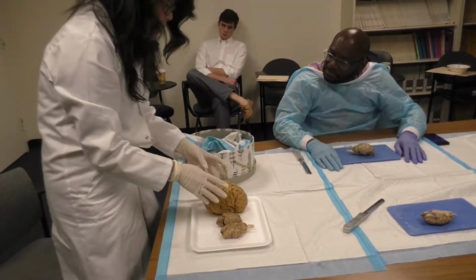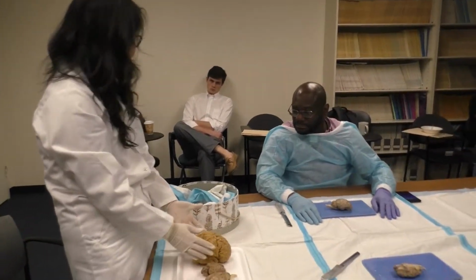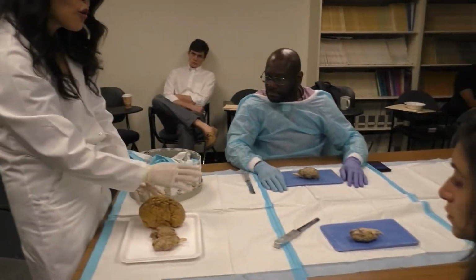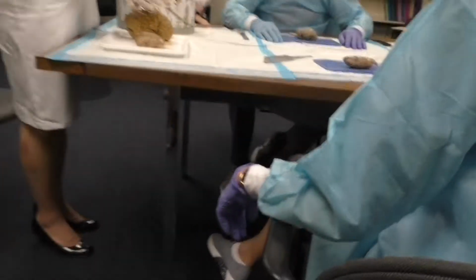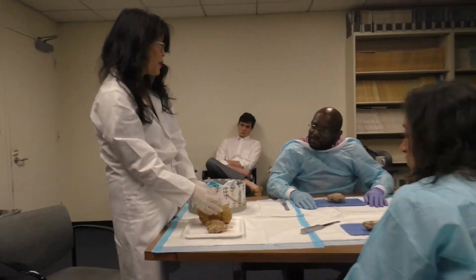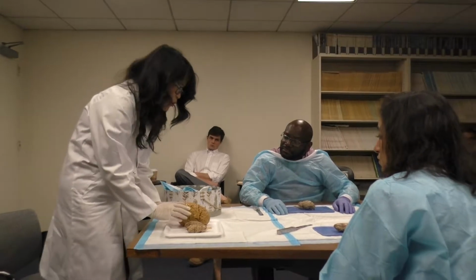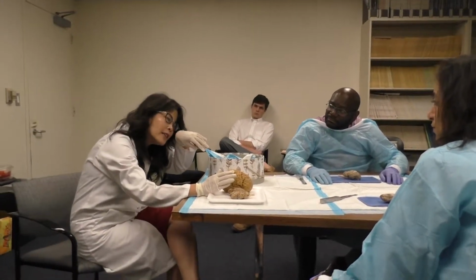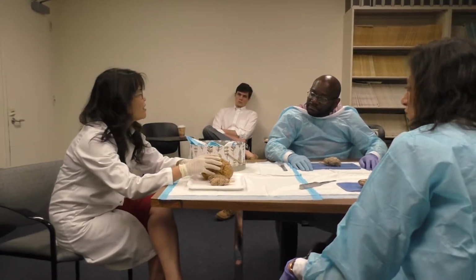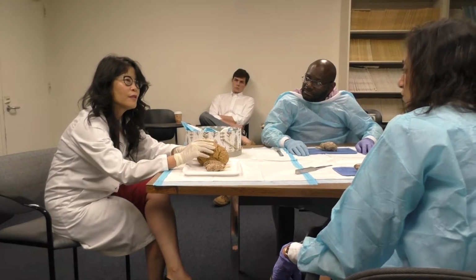Oh, sorry. And the last thing I wanted to point out that I'm sure you're all aware of is the overall structure. All brains have a right hemisphere and a left hemisphere. Everything is doubled. There is a hippocampus on the right, a hippocampus on the left, a thalamus on the right, a thalamus on the left. So why would that be? You kind of take it for granted. There's this kind of separation here. What purpose do you think that might serve?